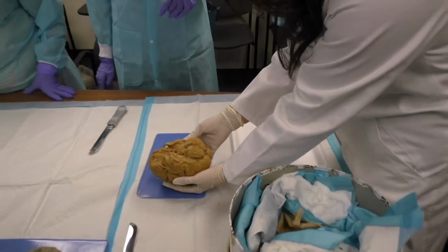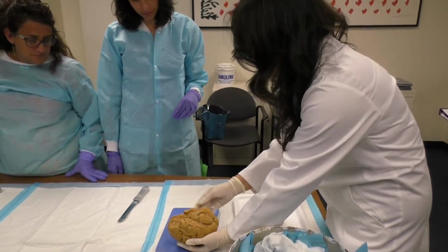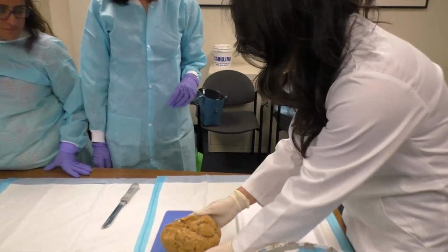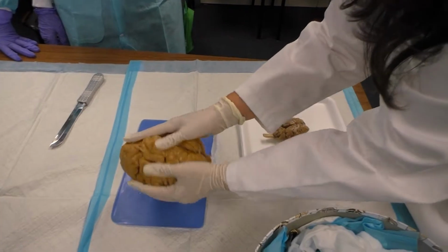The olfactory bulb is prominent on the sheep, not so much on the human. Very prominent on the sheep, exactly. And they're just small vestiges on the human brain.